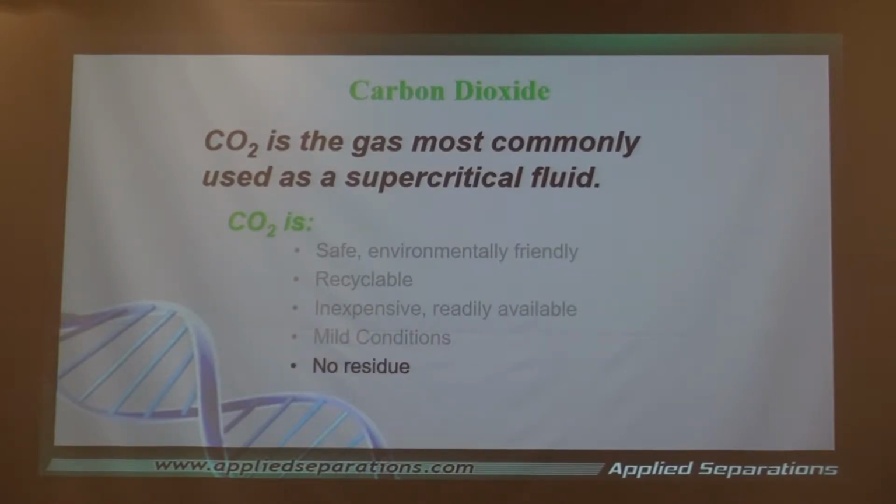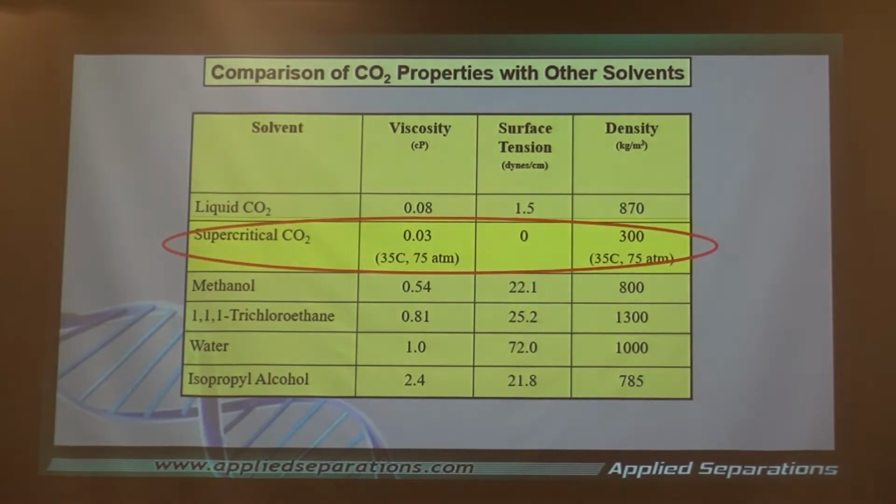As we pointed out with the coffee and the decaffeination, when we come back to ambient, there is no residue. It has zero surface tension. Well, take a look. Surface tension, zero, compared to the other solvents. This allows it to get into the small spaces. You're not held up at all. It gives you the ability to move in and out faster. You can do these extractions because you are not now limited by surface tension.